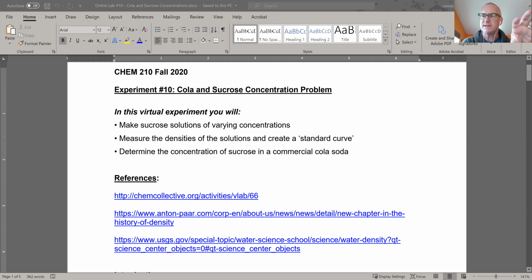Yeah, so Ryan mentions that generally when you think of a standard curve, you're looking at light passing through a solution. So you're plotting the absorbance of that solution against the concentration of that solution. But are these random solutions or are they specific types of solutions? Like in this instance, we're going to be making a series of solutions. What are we going to know about those solutions? Because we made them.